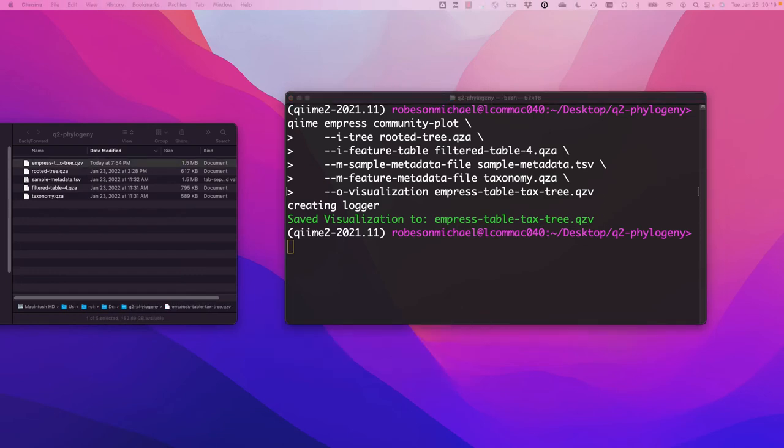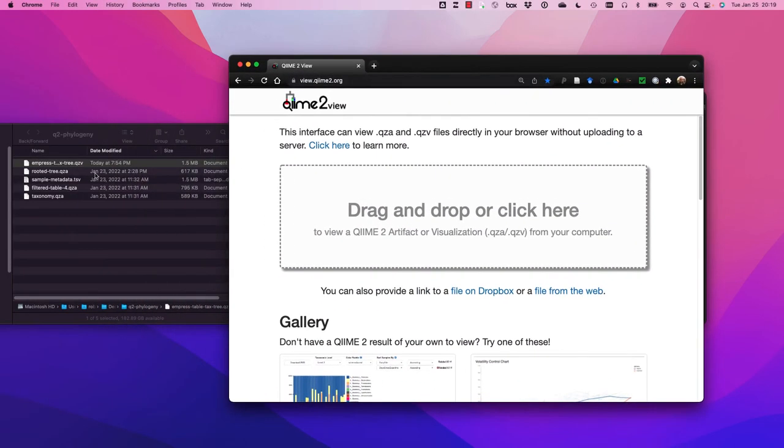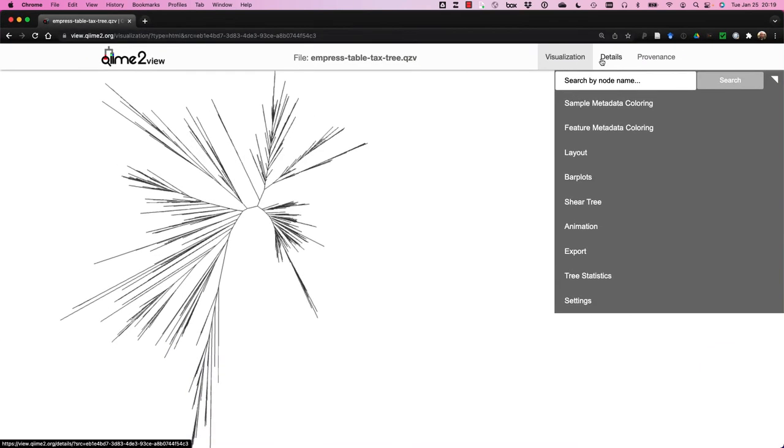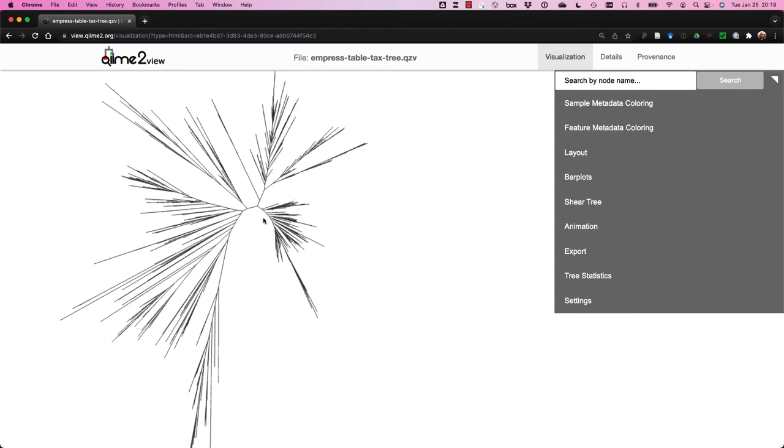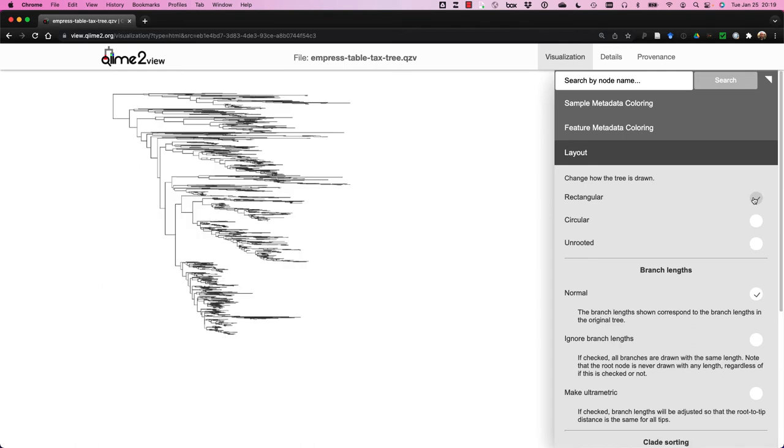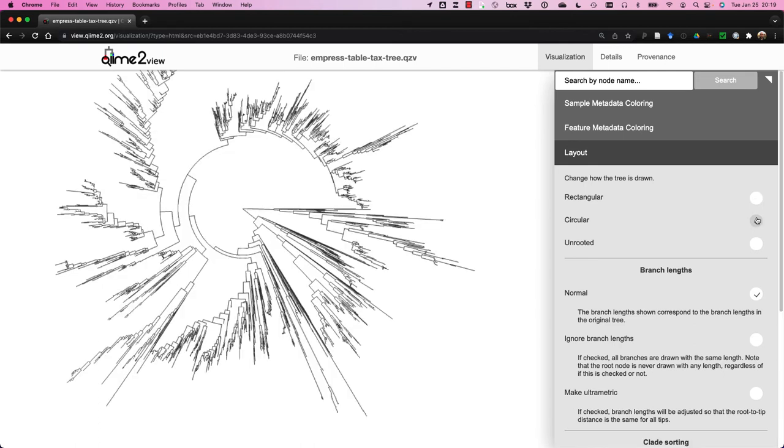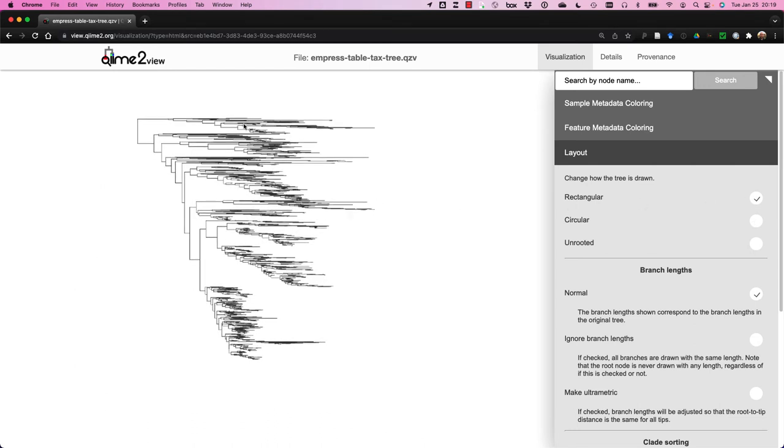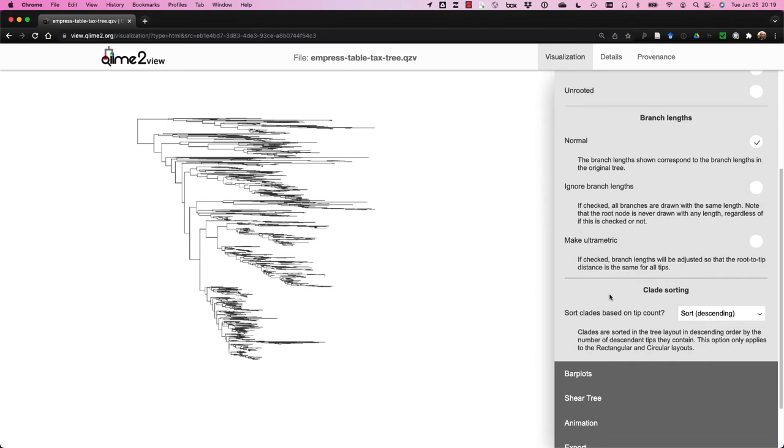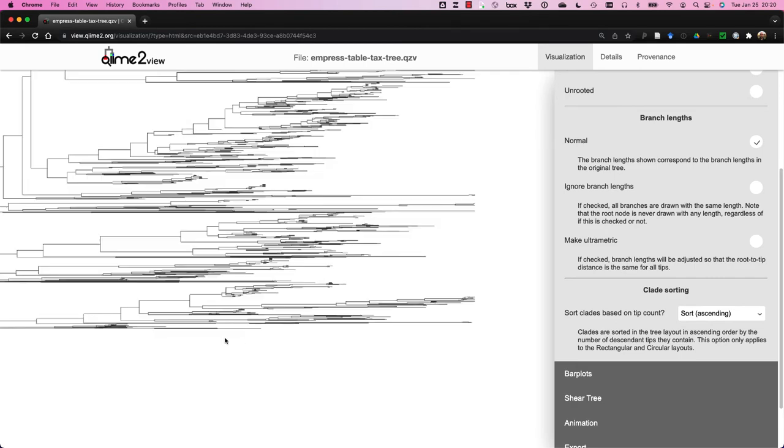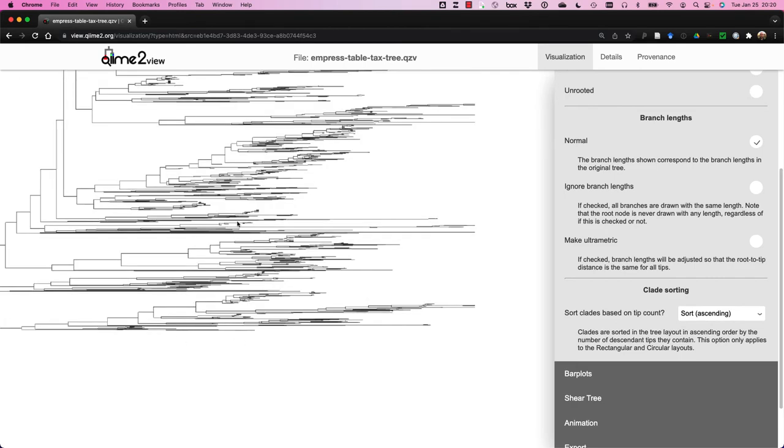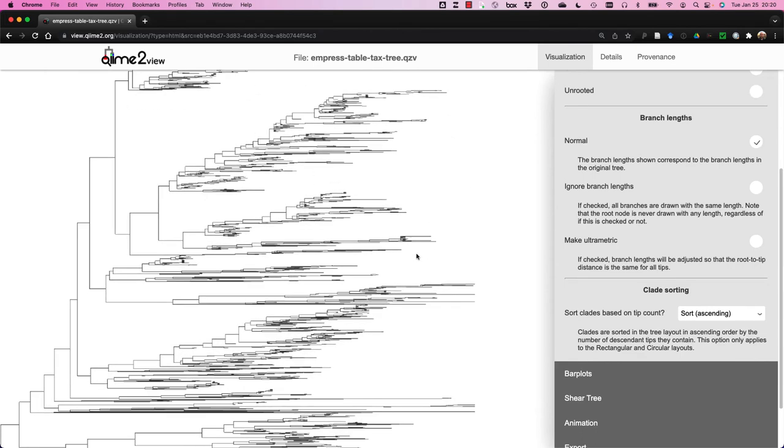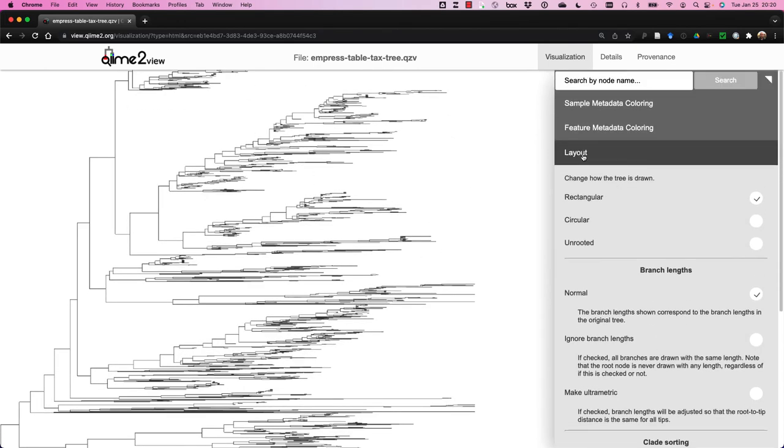Now that we have our file, let's visualize it in QIIME 2 view. Here is our tree. It's presented currently in an unrooted radial form or a network form. Now you might be asking yourself, well, didn't we use a rooted tree? Yes, we did. But this is just a visualization. And it's nice to see an unrooted form because it highlights the natural clustering of the data itself. But we can change the layout such that we can view it as a rectangular view or a circular view. So rectangular view defaults to this descending order. I prefer ascending myself because I like seeing early diverging lineages at the bottom and more recent diverging lineages towards the top.